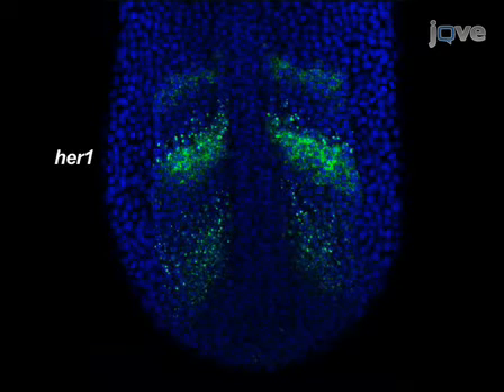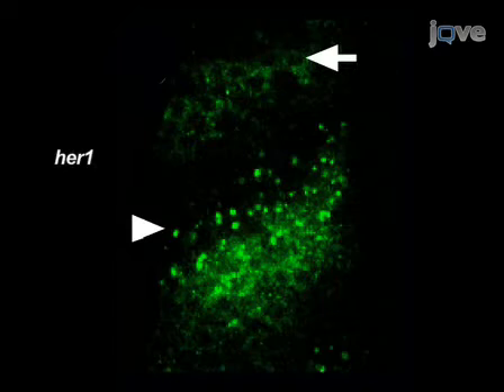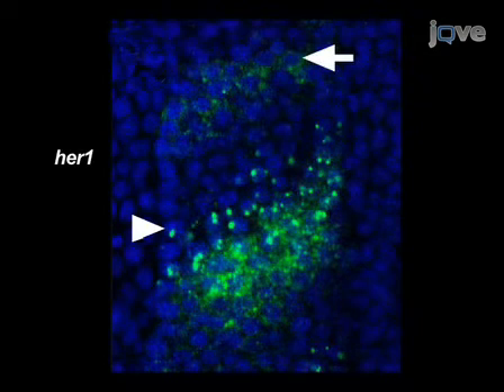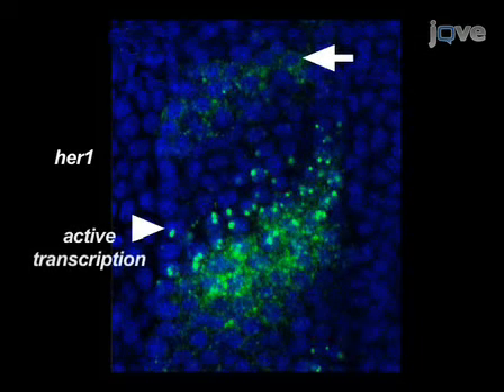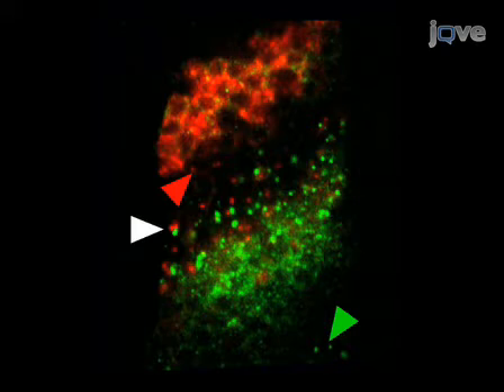These images show a single confocal section through the posterior tip of a zebrafish embryo at the 10-somite stage. The red staining shows delta-C mRNA detected with a DIG-labeled probe and TSA-Cy5 reagent. The green staining represents HER1 mRNA detected with a fluorescein-labeled probe and TSA-fluorescein reagent. Nuclei stained with propidium iodide are colored blue. In a double-stained embryo, regions of distinct or overlapping expression can be unambiguously determined. This procedure reveals subcellular localization of mRNA, as seen in close-up views of HER1 staining. Active transcription of the gene is revealed by dots of staining in the nucleus, while other cells exhibit cytoplasmic localization of the mRNA. In the double-stained embryo, we can see cells transcribing both genes or either gene separately.